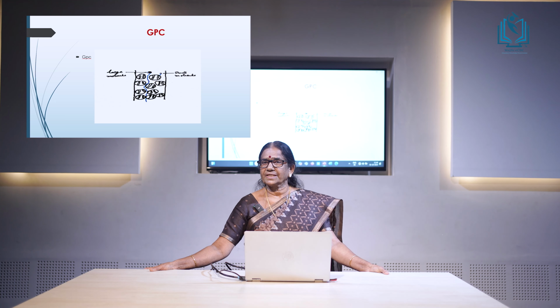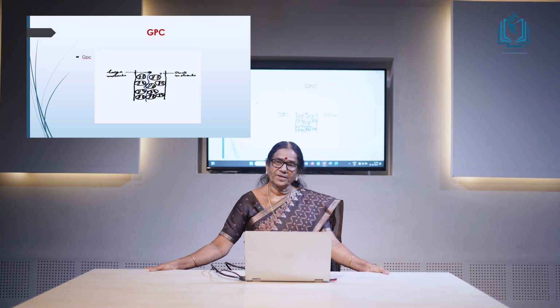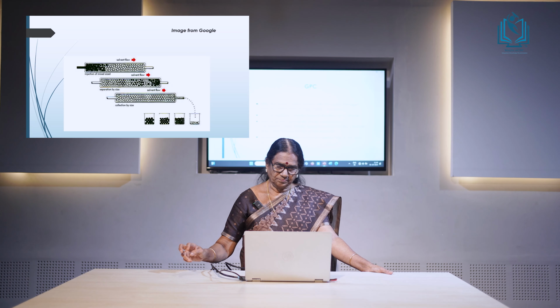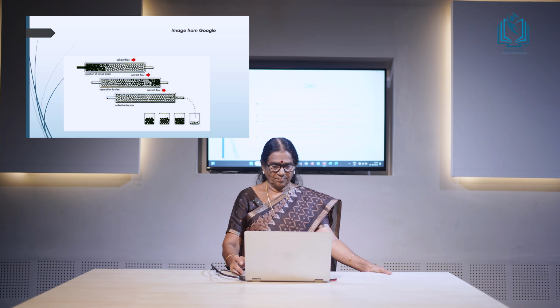So, there is a concentration gradient, and this concentration gradient will drive the smaller molecules or the intermediate molecules to the void. So, the next eluted volume will be having the intermediate molecules, and the smallest molecules will be retained within the pores for a longer time, and they will be eluted only in the last washing. The small molecules are retained for the maximum time and they will be eluted last.